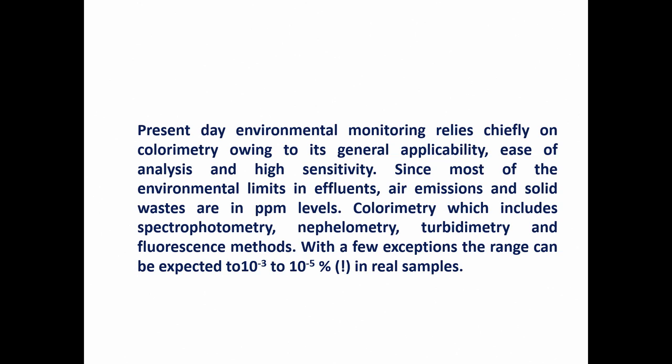Since most of the environmental limits in the effluents, air emissions and solid waste are in parts per million levels, colorimetry, including spectrophotometry, nephelometry, turbidimetry and fluorescence methods, are all applicable with a few modifications, and the sensitivity of each method can range from 10^-3 to 10^-5 % in real samples.